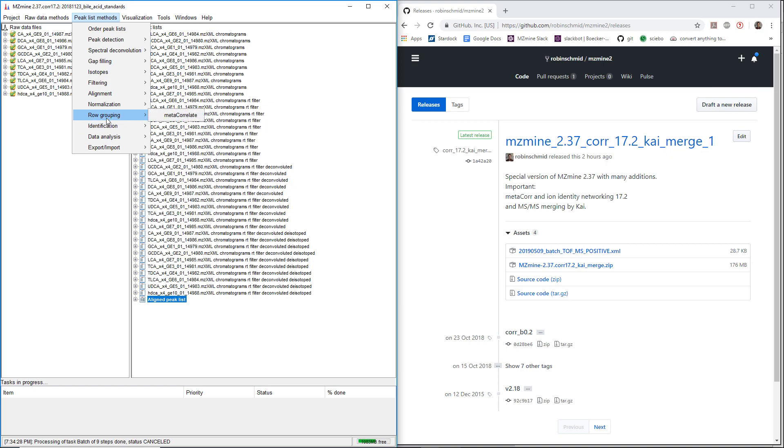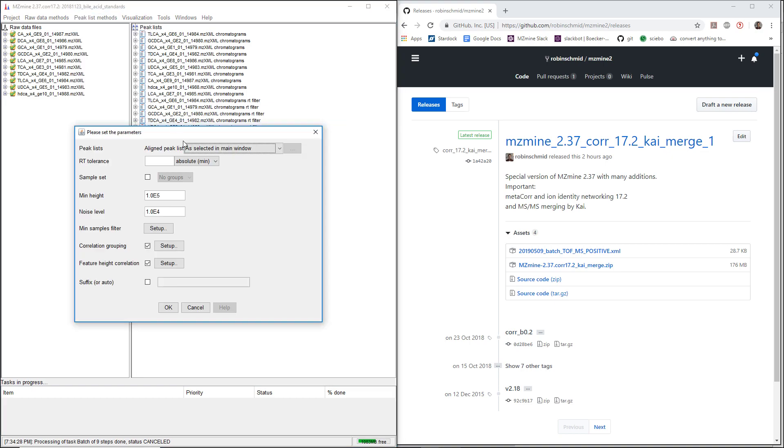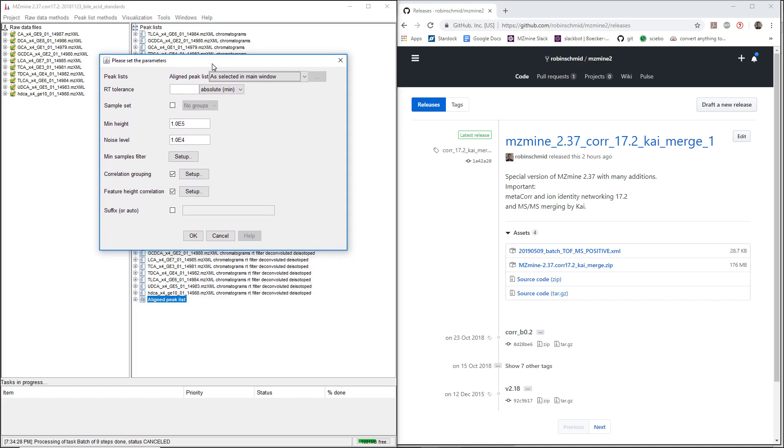The first module is the row grouping, and it's the basis of everything. We have another video that explains all the parameters and the settings for row grouping.